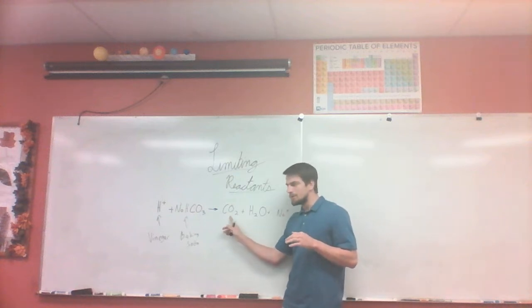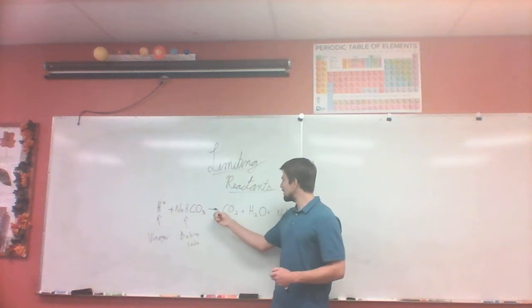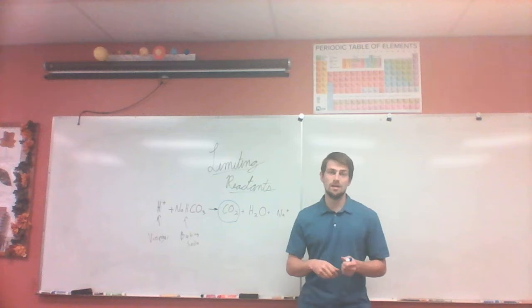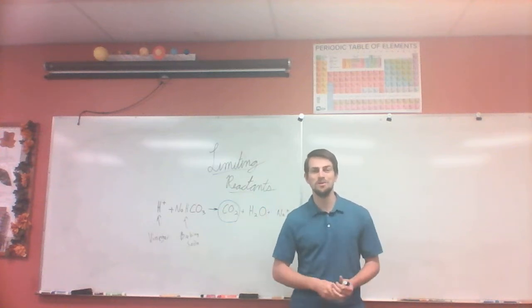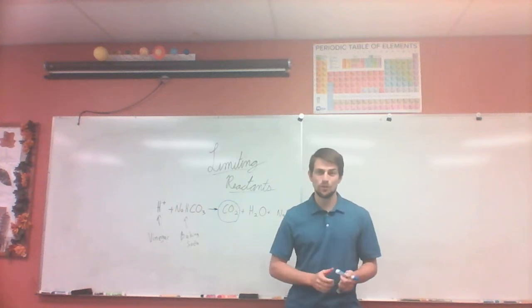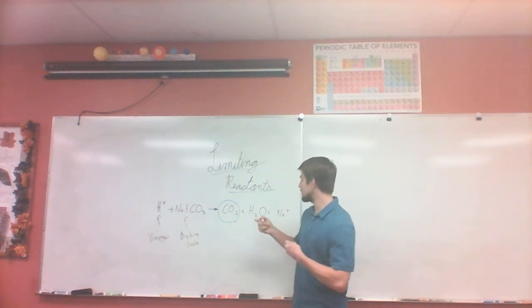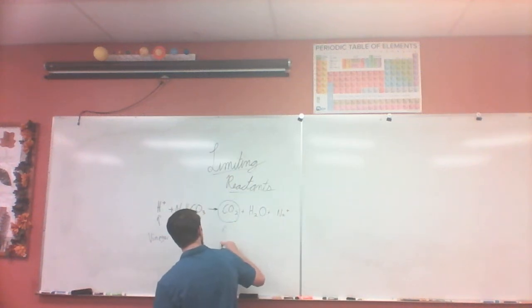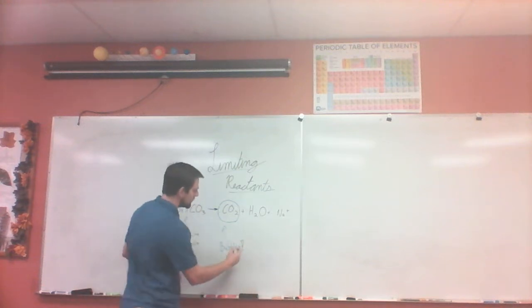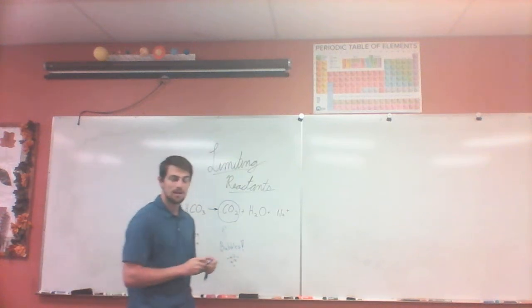But this guy right here, that CO2, that carbon dioxide, I want to take some time and think about that. Carbon dioxide is a gas. That is, it is air-like. So when carbon dioxide forms, it forms as bubbles. So if you've ever mixed vinegar and baking soda before, you see bubbles form, and those bubbles are the carbon dioxide. So you get all these little bubbles forming from the carbon dioxide.